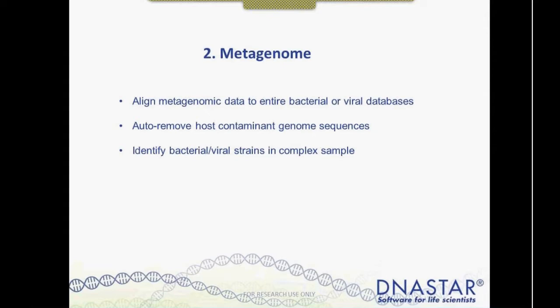In some cases, you've got a nice database. If you have bacterial or viral sequences, and you expect that the species there are going to be in the database, you can just align the data to the database and look at where the reads align to determine what the makeup is in the sample. There could be some challenges, though.